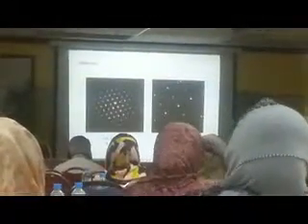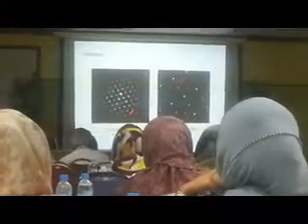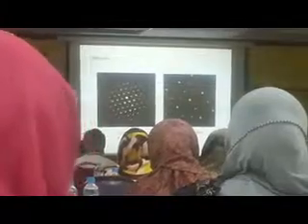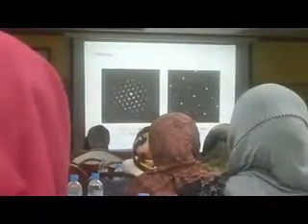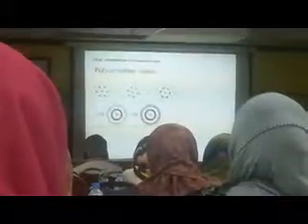And the typical diffraction pattern looks like this. If you want to know how they got the pattern, this is not the time. You can come to me anytime, I can tell you how this kind of spot pattern came out. This is not the sky. I did not take a photo from my roof. This is a diffraction image. They are not stars, they are spots coming from each and every plane. You can approach me or any other person who is relevant to diffraction and they can explain this. Okay. And when you focus your beam on a single grain, you will get a spot pattern like this.